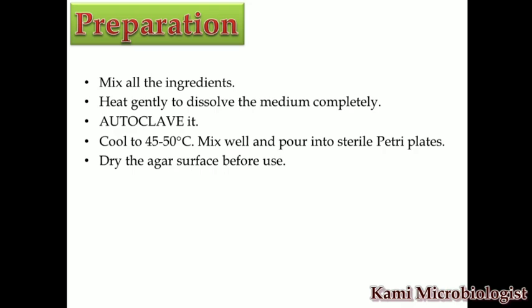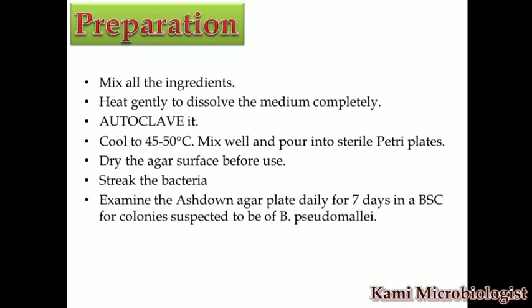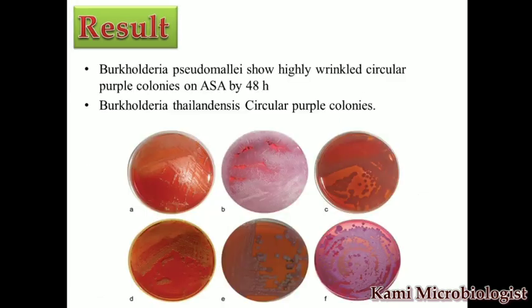Now what will you do once the media solidifies? Then you will streak the bacteria. After that you will examine the bacterial culture on the media, and you have to examine different types of Burkholderia culture every day within the week. Now this is the result that we get after incubation. These are the bacterial colonies, and these are all species of Burkholderia.